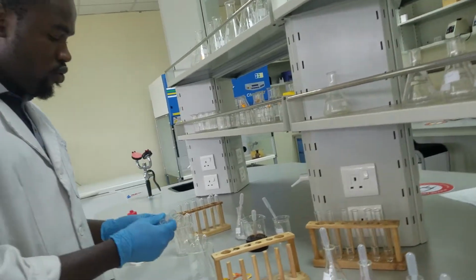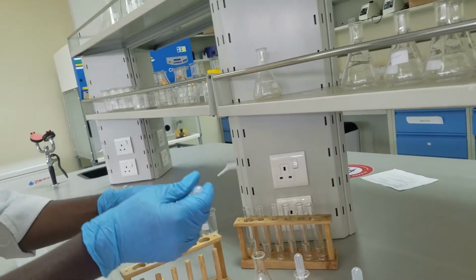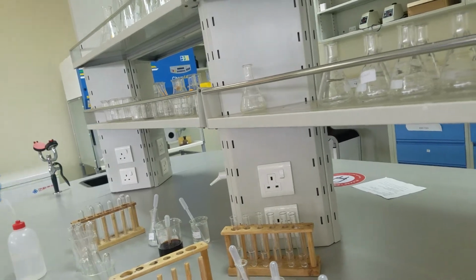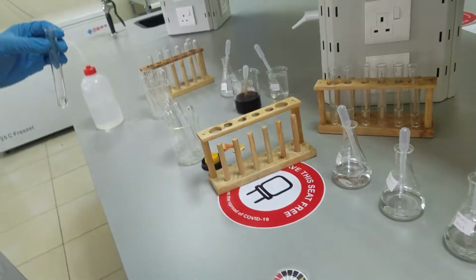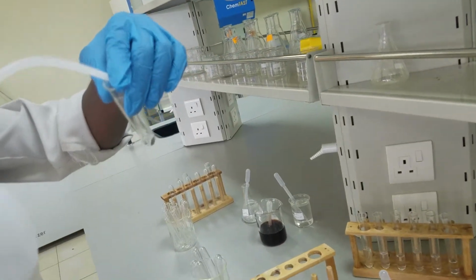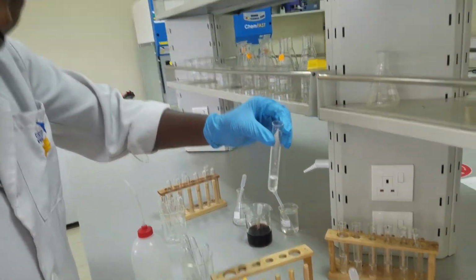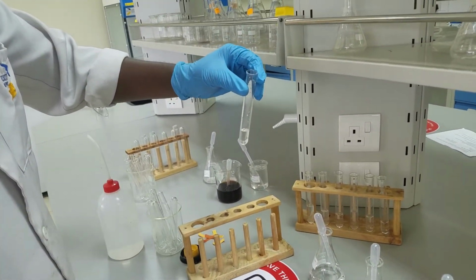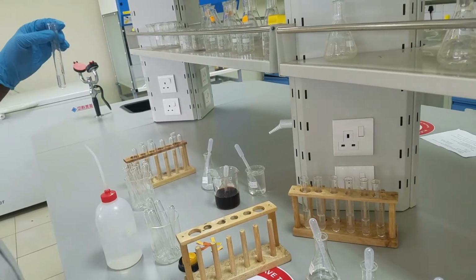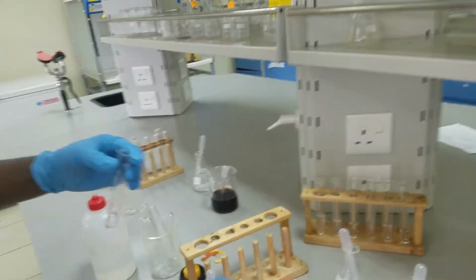So I'll start with formaldehyde. Then, as the procedure says, we add 1 ml of water. So I'll add. This is qualitative, so we don't have to be so precise or so accurate. And then we add some drops of sodium hydroxide, which is here.